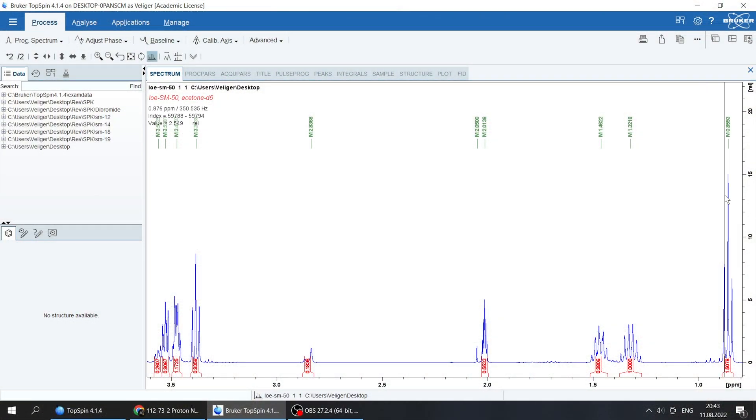Let's go to the TopSpin program. Here you can see a triplet of the CH3 fragment, system of two methylene groups nearby oxygen of butyl, CH2 fragment, and of course system for the glycol parts.